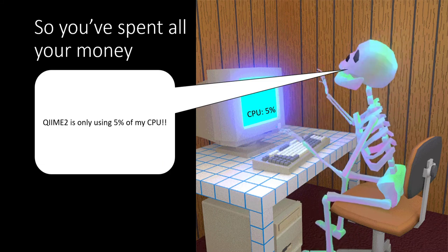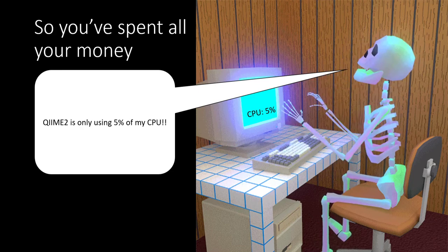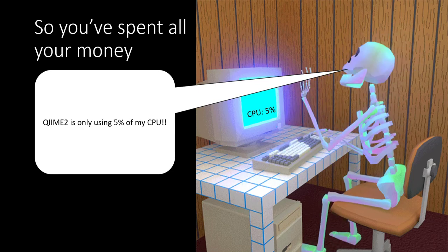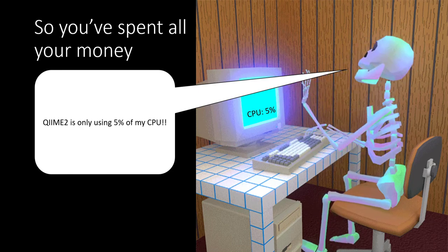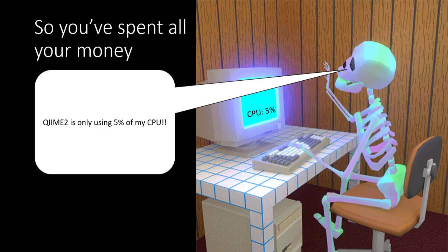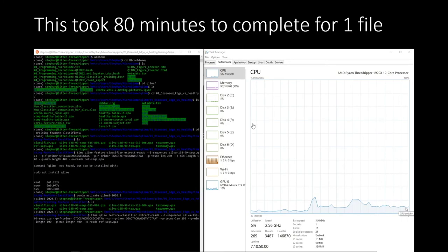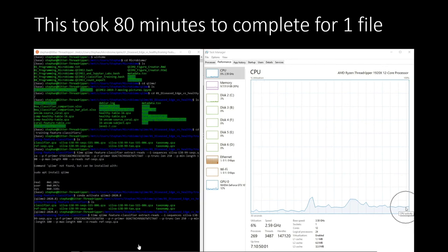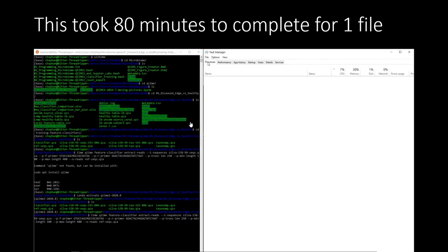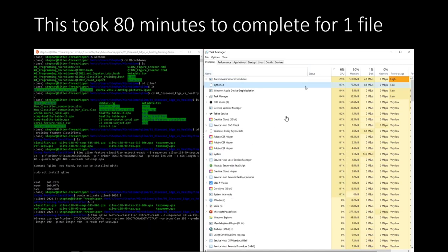Okay, so you spent all your money like I did. You spent $2,000 on getting a computer that's future-proof, and you find out it's only using 5% of your CPU. That happened to me, and I was very sad because it meant that all my haters who thought I was spending too much money were right. So processing this one file in QIIME2 took 80 minutes, and I'm showing you right now the CPU activities, so I'm training a classifier right now.